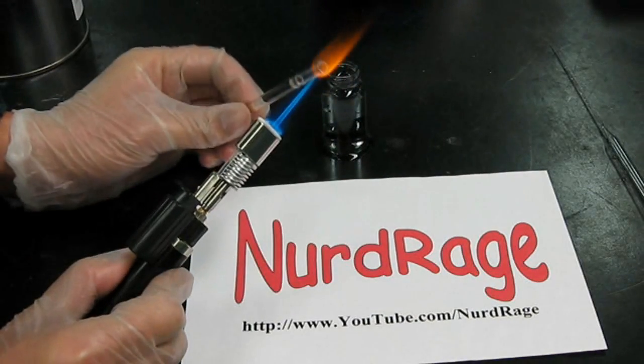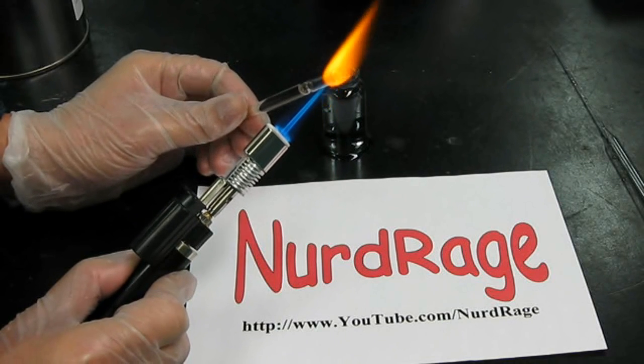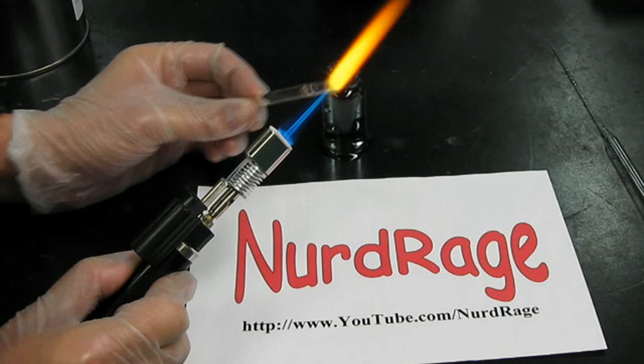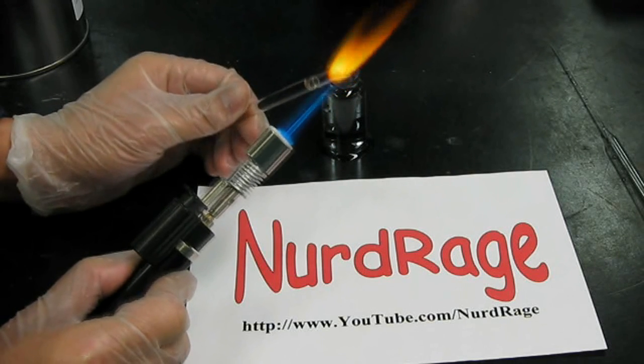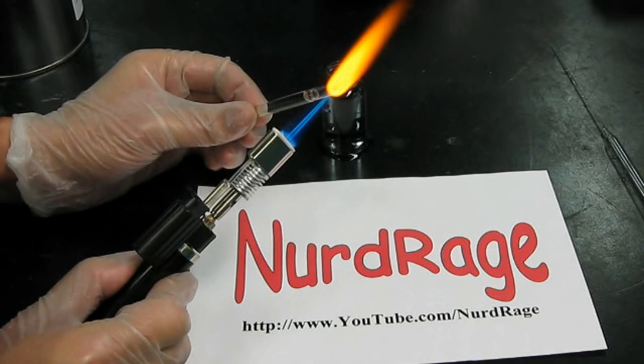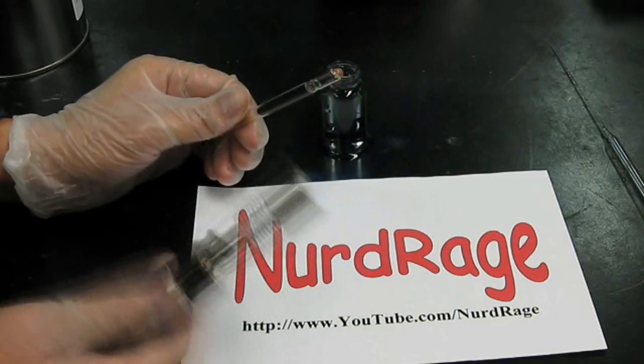I make this look easy because I've done this sort of thing hundreds of times. If this is your first time, you might get popping, bubbling, or even shattering of your glass due to uneven heating. I recommend practicing with water-filled tubes until you get the hang of it. Wear eye protection in case your tubes shatter, and always be careful when working with torches.